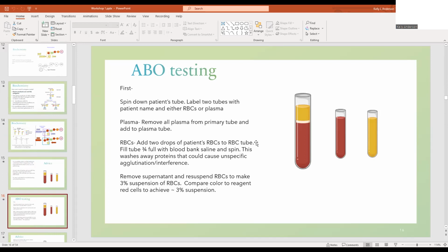And you'll see there's some other bottles on the benches. There's DI water, there's ethanol. Be very careful not to select the wrong thing to wash your cells with. If you use DI water, it's going to lyse all your cells, and you're not going to have any cells after you wash. So if you have anything near you that looks like the saline bottles, I would move it out of your way so you don't accidentally kill all your cells. The no saline water, or yeah? Yes, only saline.